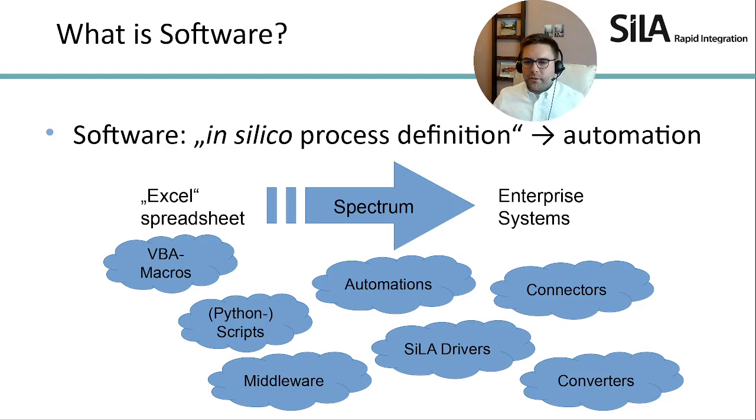So on this spectrum, you are having software, and usually these kinds of software are the ones that you are producing yourselves. So somebody is having a machine that is running a VBA macro or a Python script, and this is probably something you want to keep safe, and this is something where you do not want somebody to mingle with your data without you noticing.